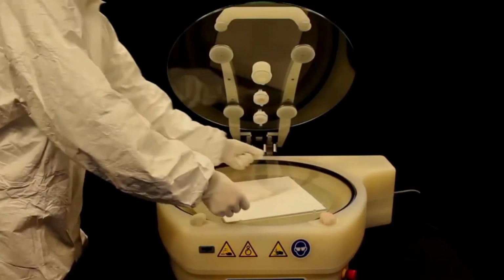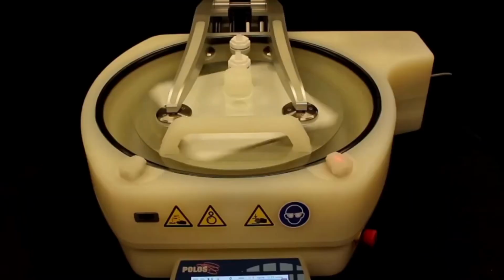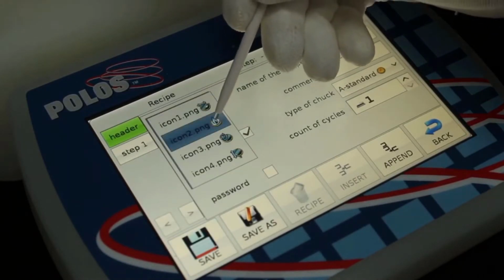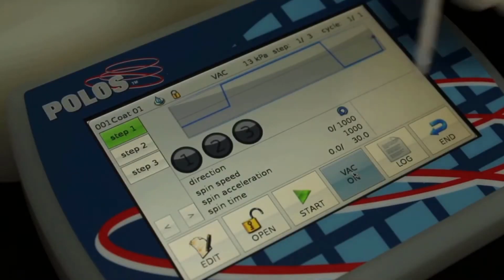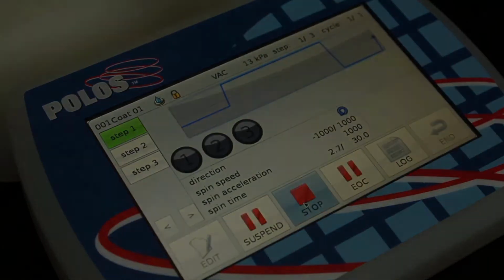In this demo, we explored how the viscosity of the coating media affects the thickness of a spun coating. A higher viscosity media will resist the flow induced by rotation, resulting in a thicker film. Another avenue worth exploring is the operating time or rotation speed. Allowing the procedure to operate for a longer period of time will allow the media more time to flow and self-thin, provided the media itself does not set into a stable deposition. Increasing the rotation speed would assist in the thinning of the film.